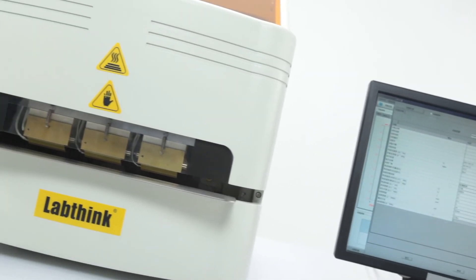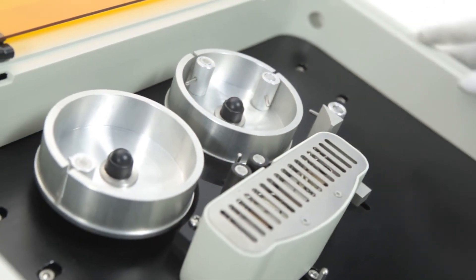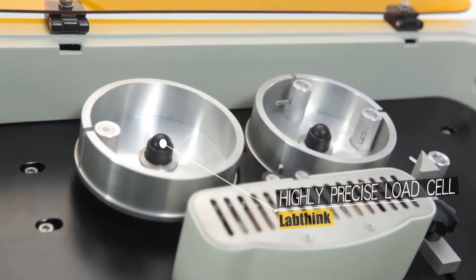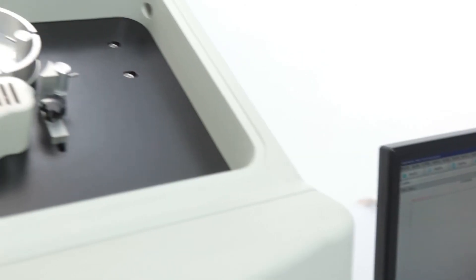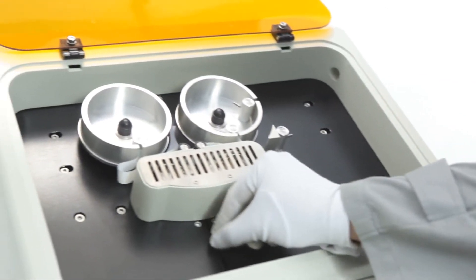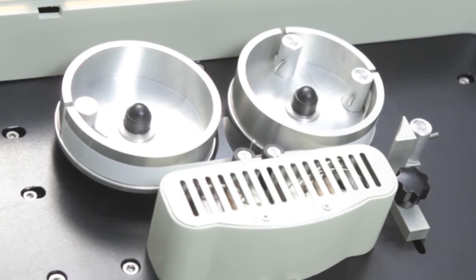The wide range of 0.05 megapascal to 0.7 megapascal and broad timing setting from 0.1 to 99.9 seconds meet the varied requirements of customers. Highly precise load cell can be selected from different specifications and can be replaced easily. Three testing speeds can be selected and customization is also available for varied needs.